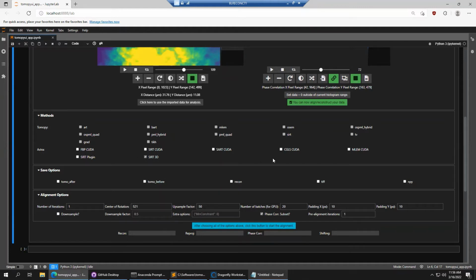I have a quick question. How does that contrast to ART? Because I've been using ART as the algorithm for all of my stuff, but I don't really have a good handle on how that differs. I didn't know there were so many. There are a ton of them, and I don't know anything about them.